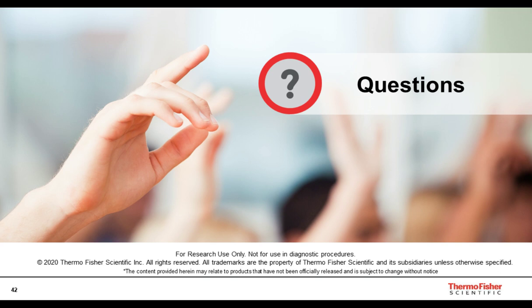Right, great question. For the TrueTag system, we are working with donors with a maximum length of about 1.5 kb, and that's where we've done most of our development work around the double-stranded donors in that configuration. We're looking at that 1.5, maybe 1.6 kb in length. Our services team have done knock-ins up to 5 kb for custom projects for our different scientists, but the development work that we focused on here is going to be that 1.5 kb size or smaller.